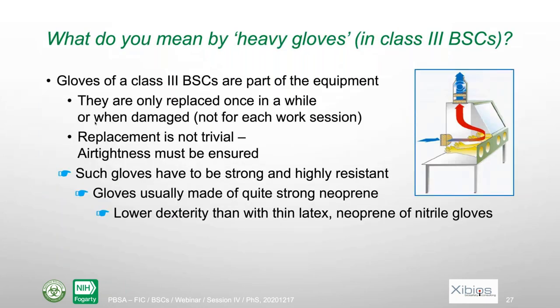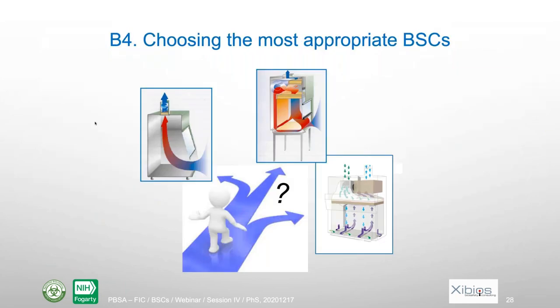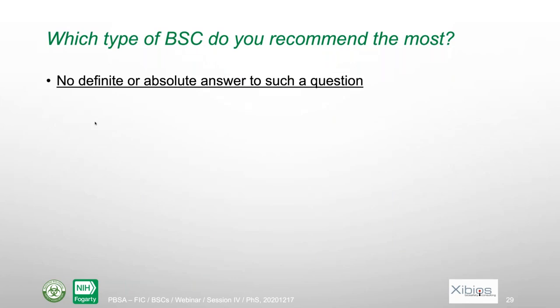I answered this one during the session, and so now it's the next session, the next part on choosing the most appropriate biosafety cabinet. The first question is very general. It's which type of biosafety cabinet do you recommend the most? And actually, I don't have a definite and absolute answer to such a question. And I think nobody could have a really good answer to such a question without knowing your activity.